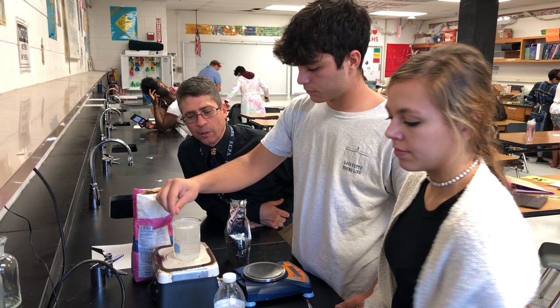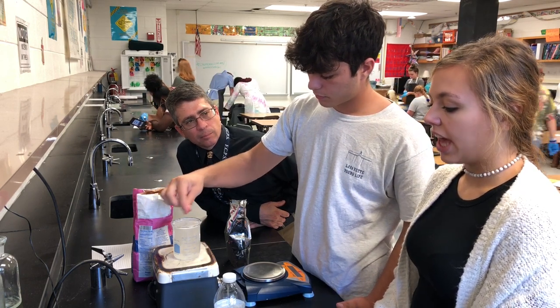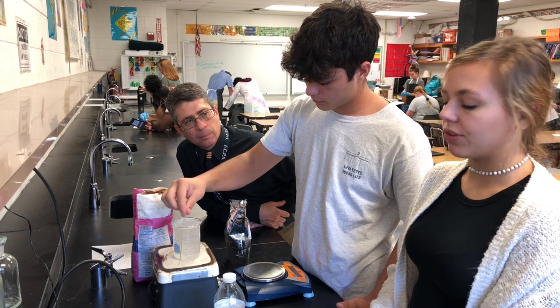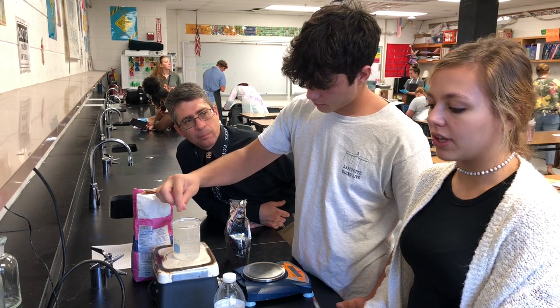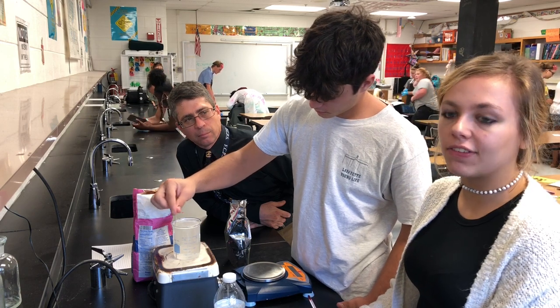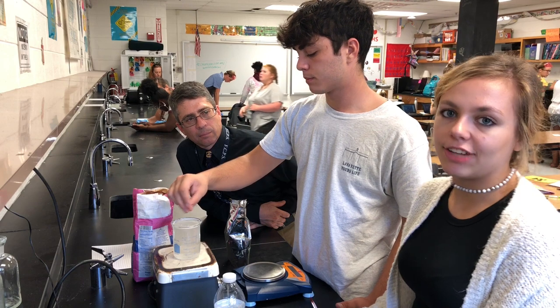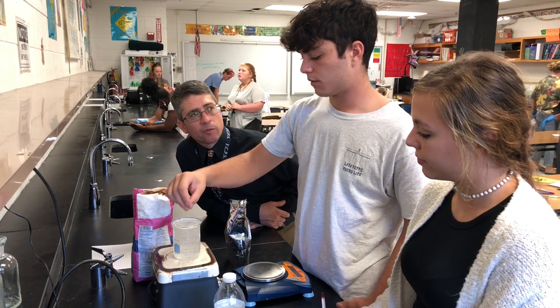So what do you think you learned from this lab? Haley, what do you think you learned from this lab? One of the main purposes was learning how to set up a lab notebook and how to really record everything you do and the importance of keeping it. And we also learned the process of fermentation.